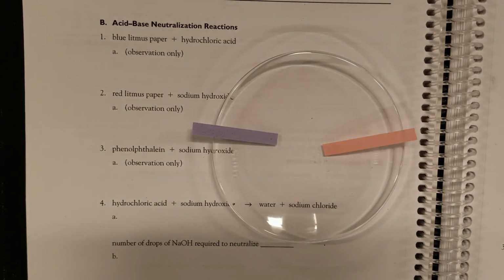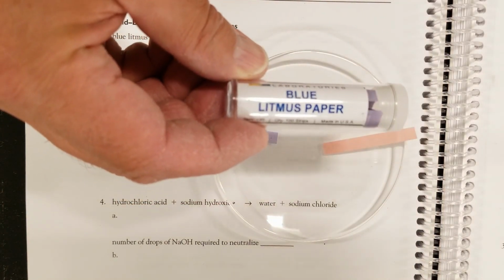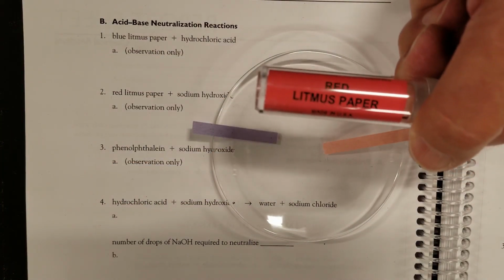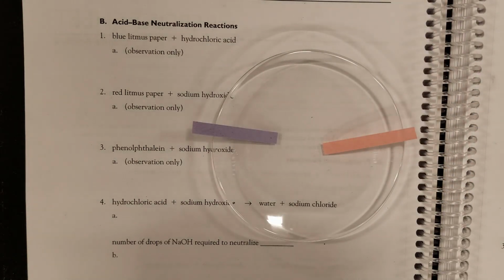Okay, now we're going to look at some acid-base reactions. First, we're going to show you litmus tests. Litmus paper comes in 2 different flavors. You have blue litmus paper and red litmus paper. And these are used to tell if something is either an acid or a base.